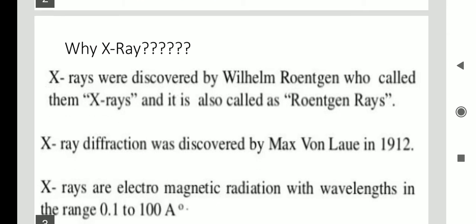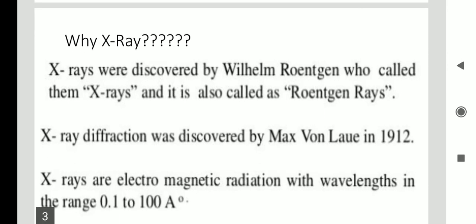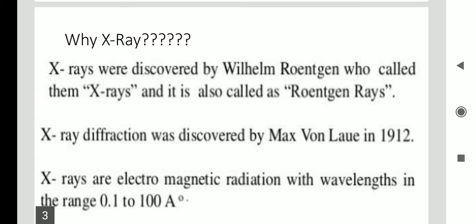The first X-ray diffraction was discovered by Max von Laue in 1912. The first X-ray diffraction was discovered by Max von Laue in which year? In 1912.